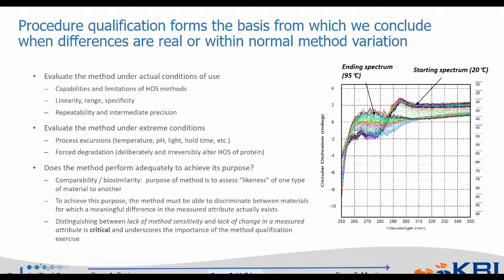And it can be also under forced degradation conditions outside of what we would think the protein product would undergo during routine processing. The reason that we perform forced degradation experiments is to deliberately and irreversibly alter the higher order structure of the protein to ensure that when the structure actually changes, that the method is sensitive to those changes.